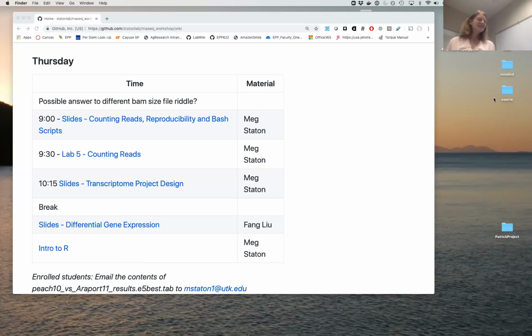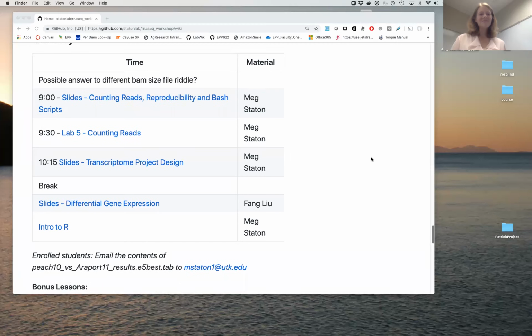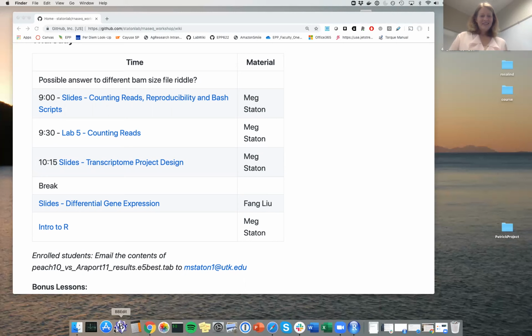I also found, and this is another read-the-manual moment for me, that STAR has a flag where you can set the compression level of the BAM file. So when you're running STAR, you can spend the extra time to go for a high level of compression, use the default, or go for a lower level of compression that might be a bit faster. It's in the STAR manual. It's deep, there are a lot of flags in there, but that one was on page 23 if you want to look at it. That was really cool. Good find.